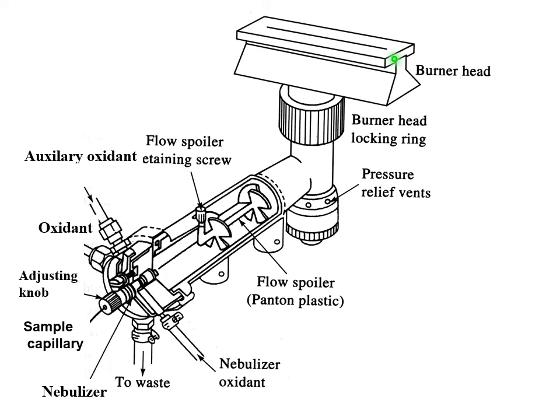We do not want to use a 1 centimeter cuvette. We are using a burner head that allows us to have the flame along our beam. So we'll direct the beam along the burner head, and the length of our flame will be not 1 centimeter, but perhaps 15 centimeters or something.